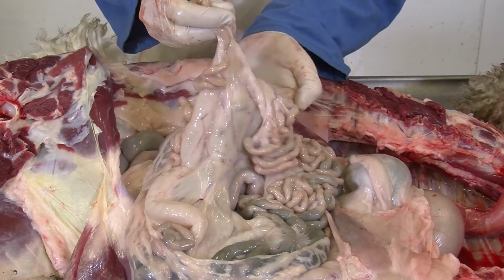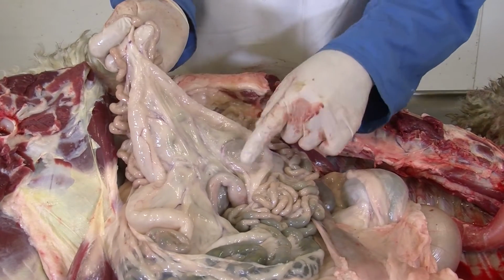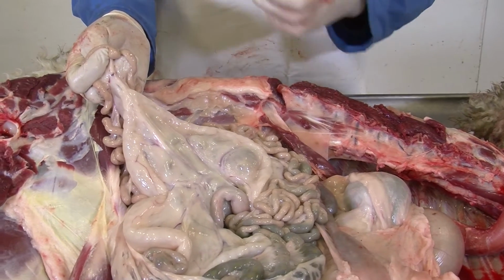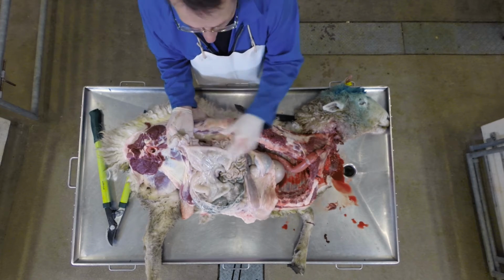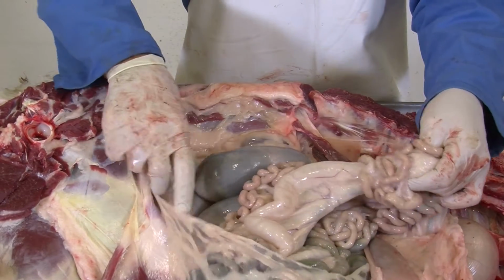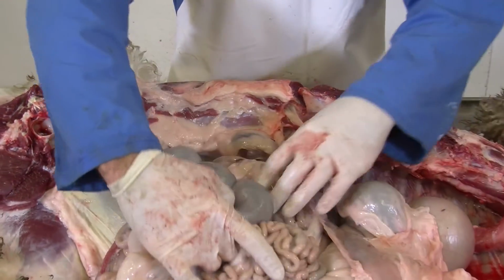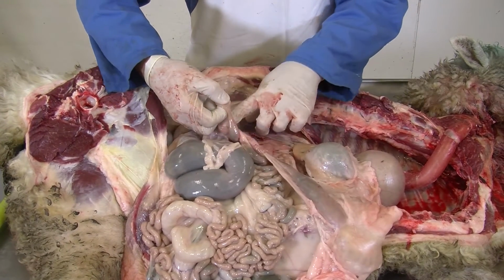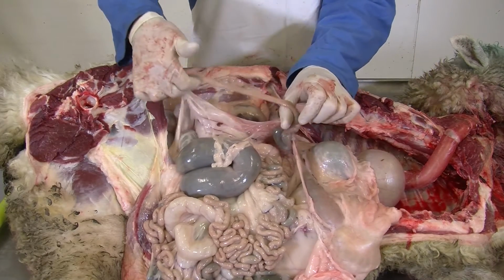So the small intestine is all around the edge of a membrane here, and in that membrane you can see the blood vessels that are going to the small intestine and picking up the nutrients that are being absorbed here and taking them to the liver. So there's meters and meters of it. You can see here large intestine. As I say, we're going to go through all of this in much more detail later on. So what I'm going to do here, this is again the start of that small intestine here.